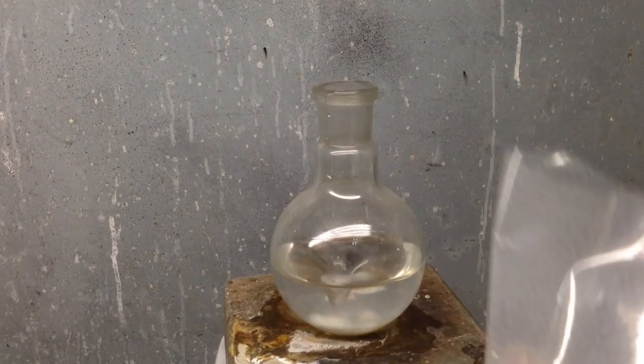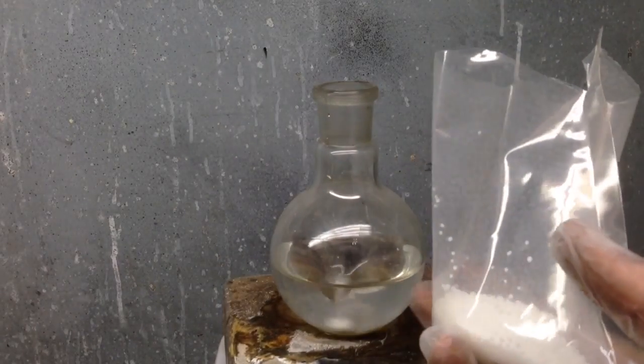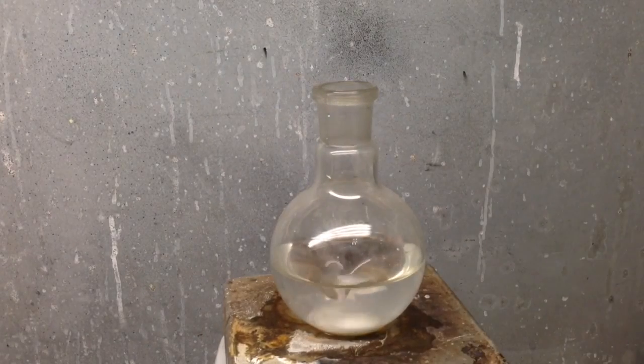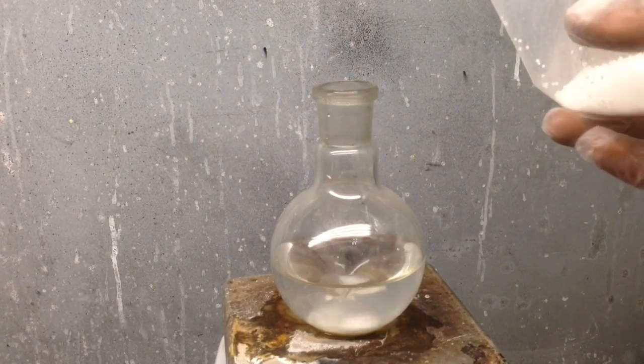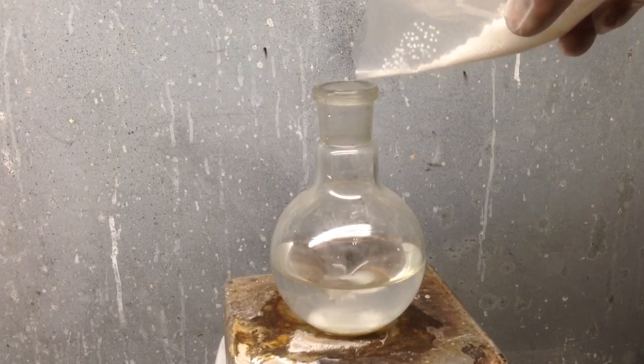So you want to start by adding your sodium hydroxide to your water. So I've got 40 grams of sodium hydroxide, 100 milliliters water. It's on a stir. This is actually cold water too. So it helps to keep the boiling down a little bit. So we'll go ahead and add that.